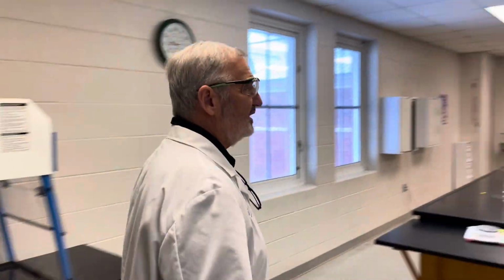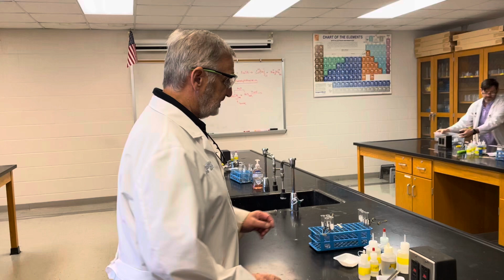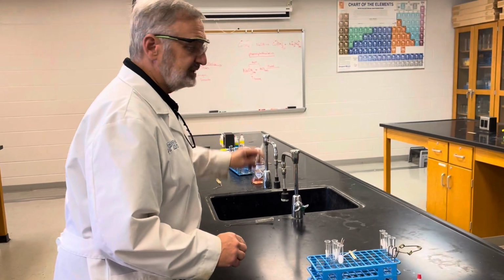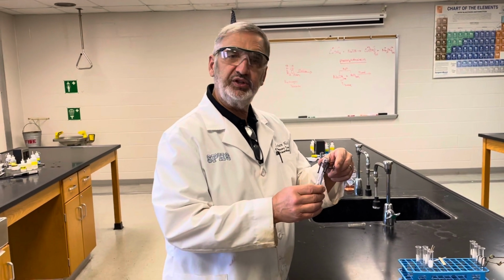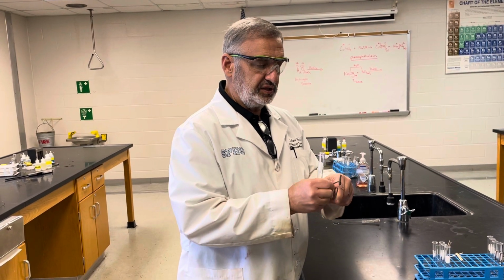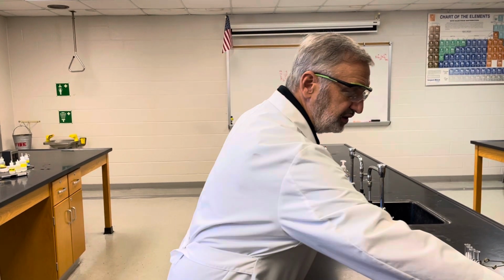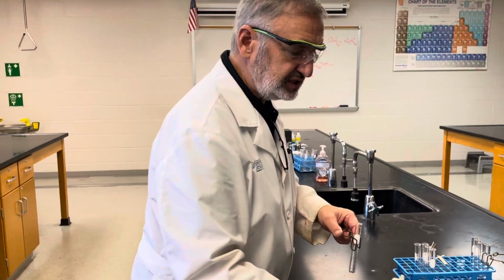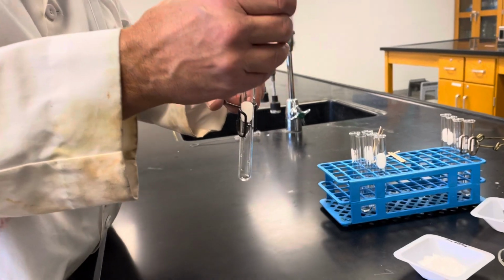Now, when we come over here to the second one, they want us to take some sulfuric acid. Now, when you are doing a reaction in a test tube, you never want to hold the test tube in your hand. You always want to make sure that you use a test tube clamp, or you just do it in the rack. So we're going to take some sulfuric acid, and we're going to fill a test tube. This is a totally qualitative lab, so we're just going to take some. We're going to put it into here.